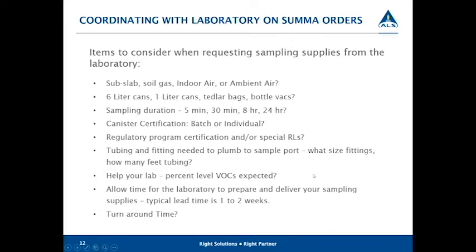Like I said earlier in the previous slide, if you have percent level VOCs or high levels of VOCs expected, please communicate that to the lab on the chain of custody or provide your PID readings. Allow time for the laboratory to prepare and deliver your sampling supplies. Typical lead time on a Summa canister order is 1 to 2 weeks. And also, of course, what turnaround time do you need?